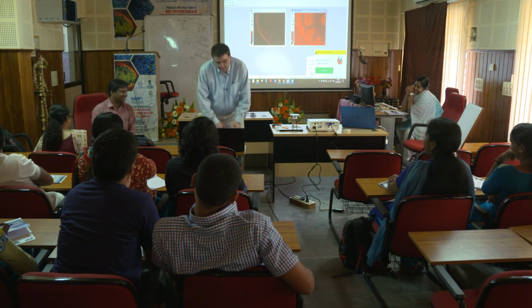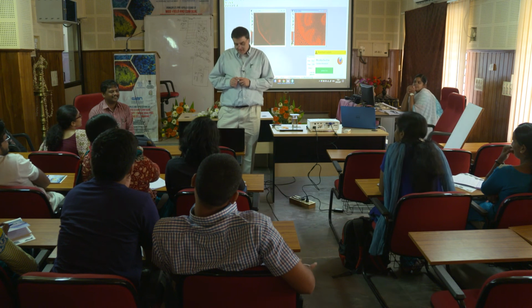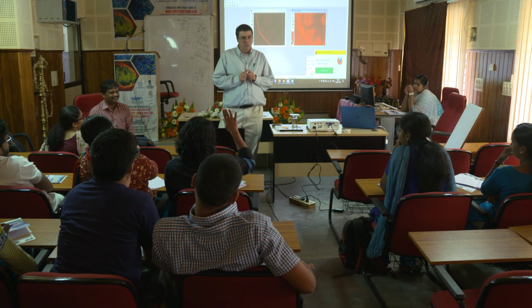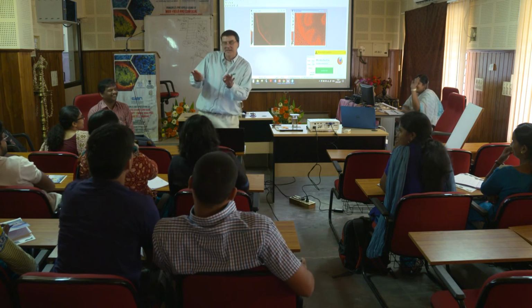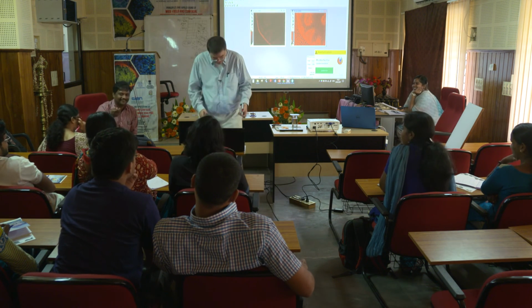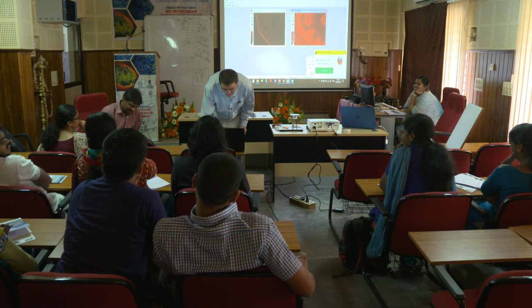Okay. The difference between the excitation peak and the emission peak of a fluorophore is called what? Well, you already got one. If you already got one, you got to keep your hand up. Stokes shift. Okay.